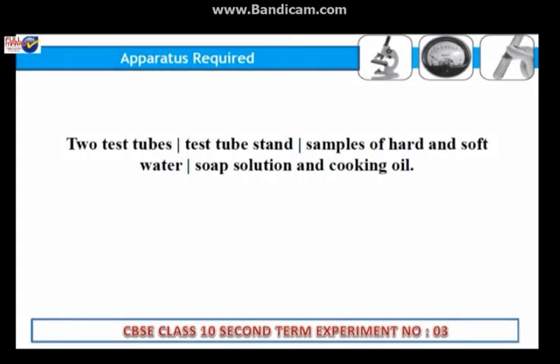Apparatus required: two test tubes, test tube stand, samples of hard water and soft water, soap solution, and cooking oil.